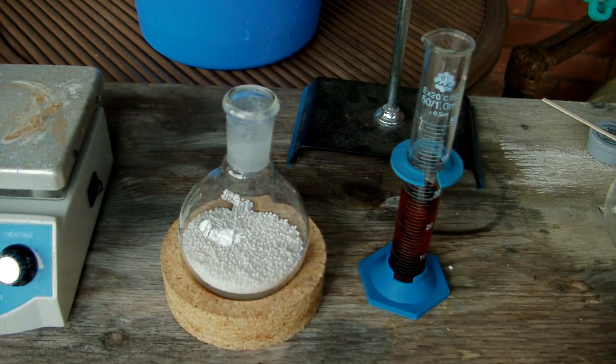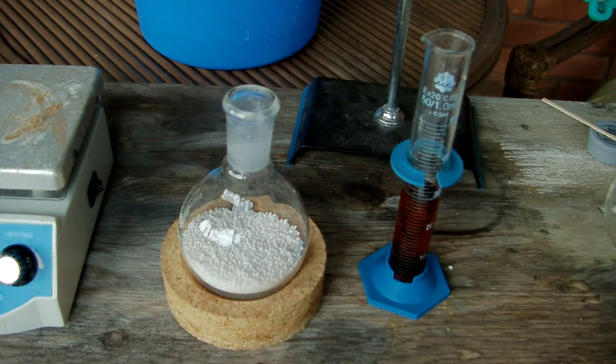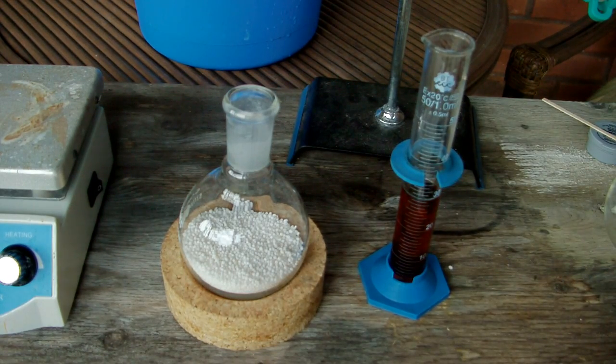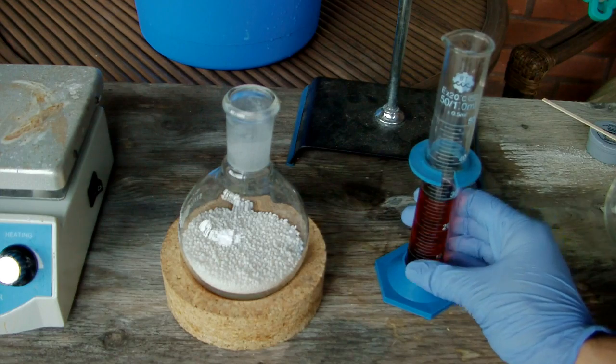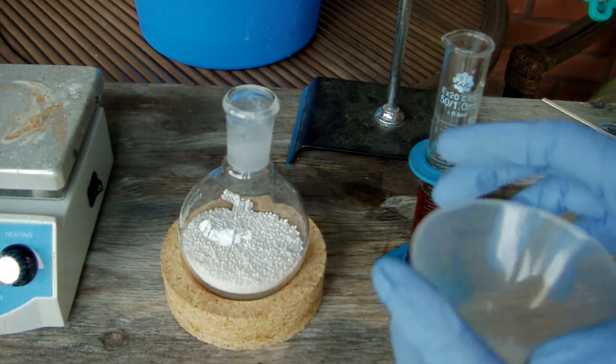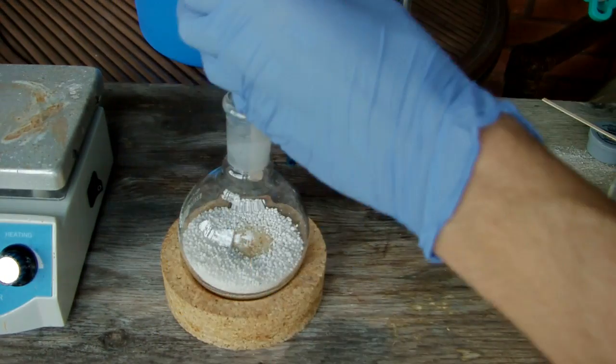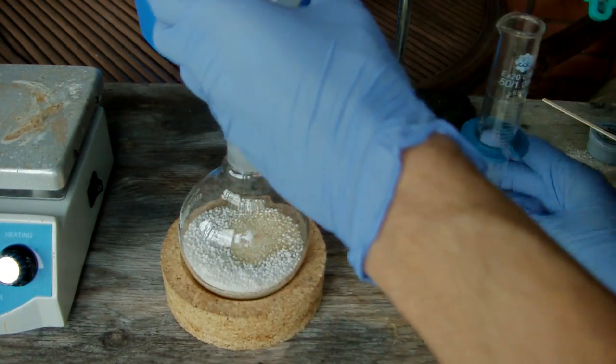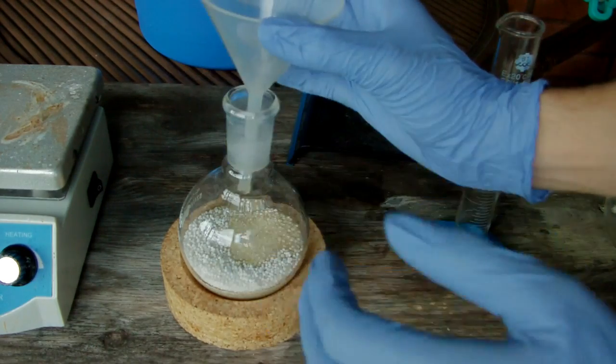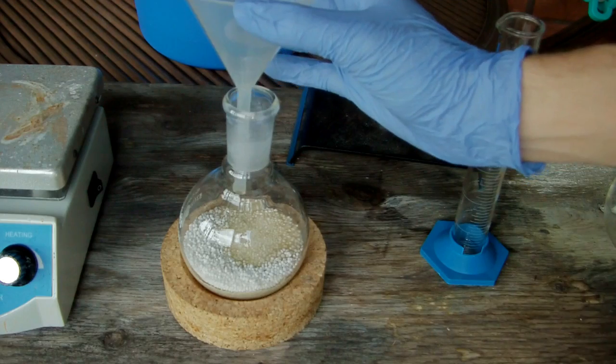So all I'm going to do is pour the one into the other, and it'll make the nitric acid in situ. And to separate it, we have to heat this thing up to the boiling point of nitric acid, which happens to be 83 degrees Celsius. Okay, so now that those are reacting, I'm going to assemble my distillation setup.